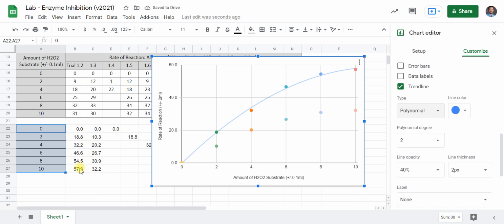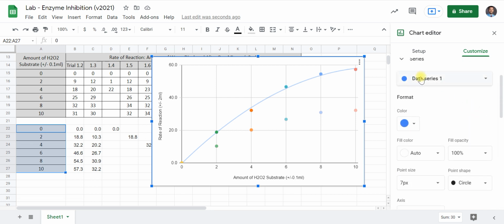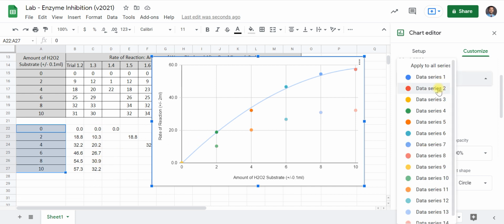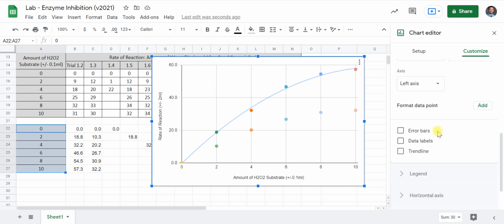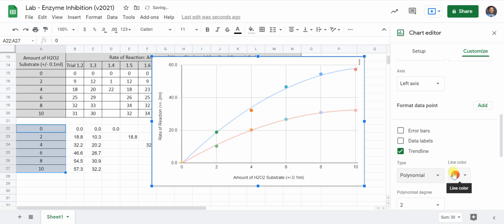What we've done here is we've taken this first series. It's technically not the first series, but again, just bear with me here. Our first series after this X here, and we've created a trend line. Now we're going to go up and click on the second column here, which should be data series 2. And we're going to do the same thing. We're going to enter a trend line for this, and it's curved, so we're going to go ahead and click polynomial like this. So there's our curve. Now we have a curve that beautifully fits those data points, and I like that.